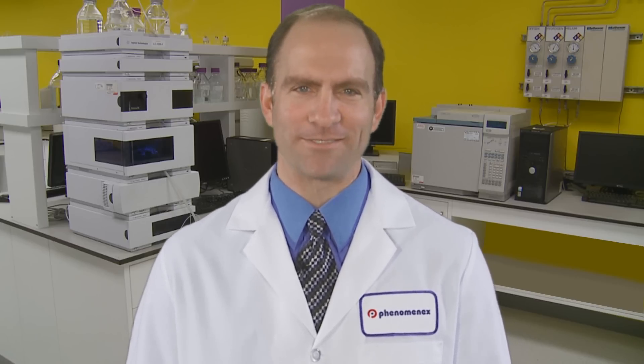Before we start, let's get familiar with the parts of your cool lock nut. Your cool lock nut has three main sections: the locking nut with ferrule, the main body, and the upper ferrule.